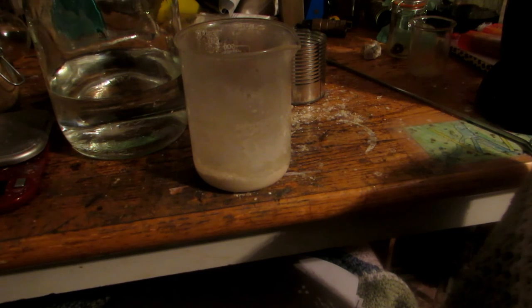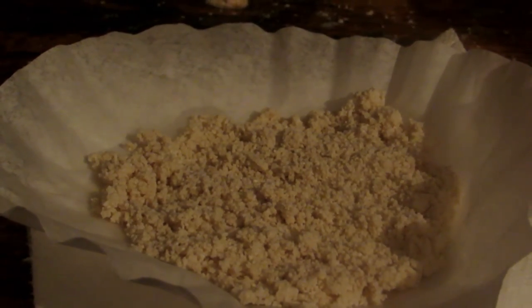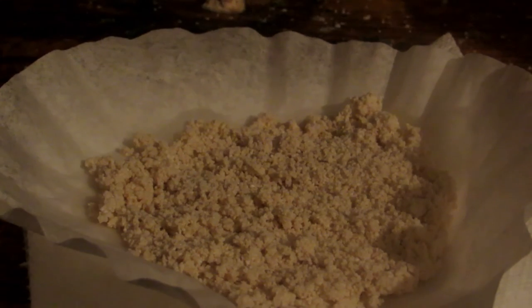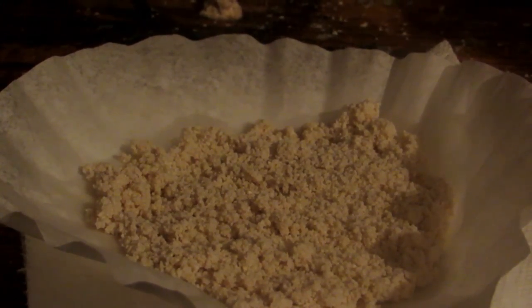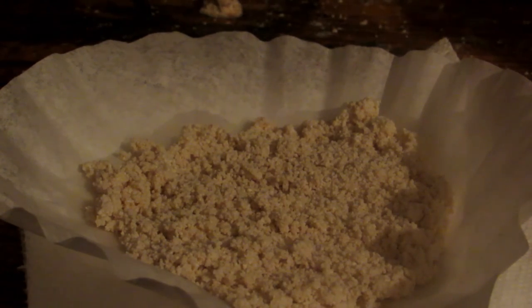We must now filter it, and I will save the ethanol for future distillation runs to recover the ethanol. After filtering it off, we just put it on a coffee filter on some paper towel to finish drying. I've put the ethanol in my ethanol waste container for fractional distillation in the future to recover it, because I don't want to waste it. We'll evaporate the rest of the ethanol from this mixture until it's nice and dry.